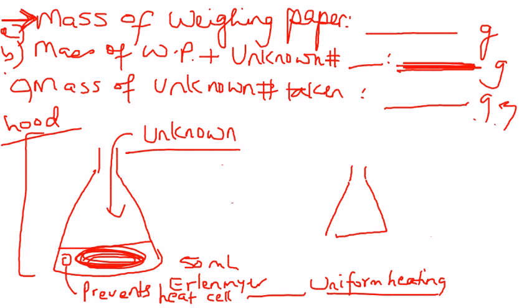and an Erlenmeyer flask. The reason why you want to use a stemless funnel is because if you had a stem, then all of your solid is going to start to crash out within that glass funnel, and you don't want that. You don't want premature recrystallization. You want it to make it through the filter and crystallize here in the flask.